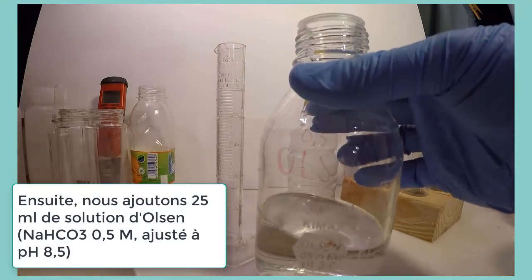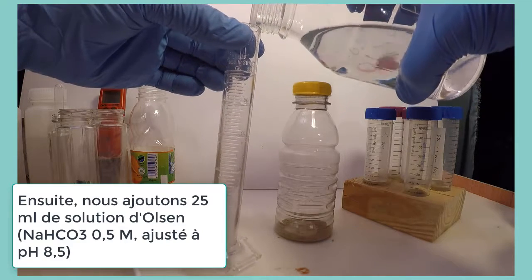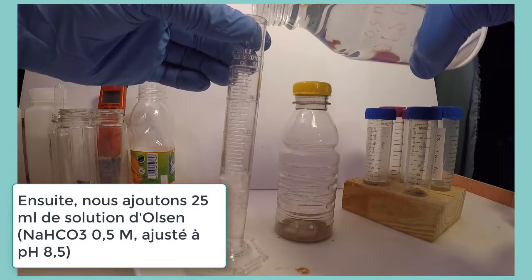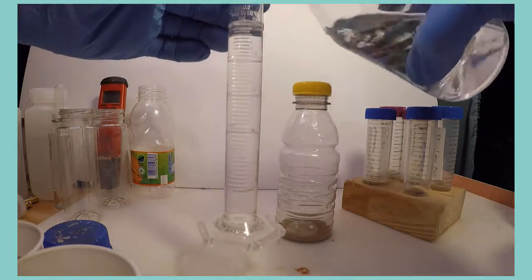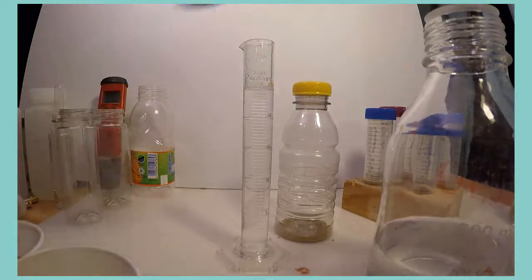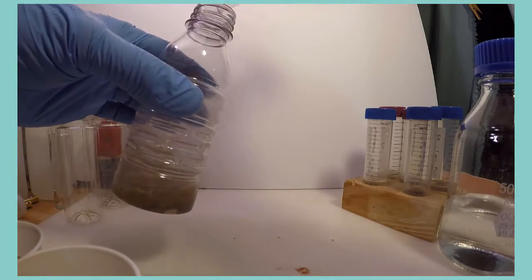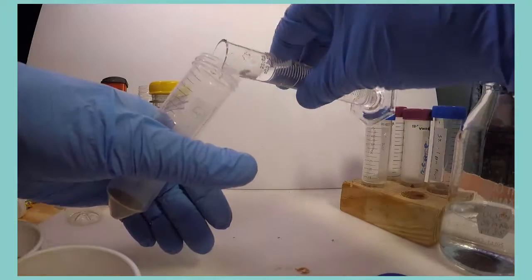Now we add 25 milliliters of Olsen solution, which is half molar sodium bicarbonate adjusted to a pH of 8.5. We add this amount to each tube or bottle with the soil sample inside. After adding the Olsen solution, each bottle should be shaken for 20 minutes.